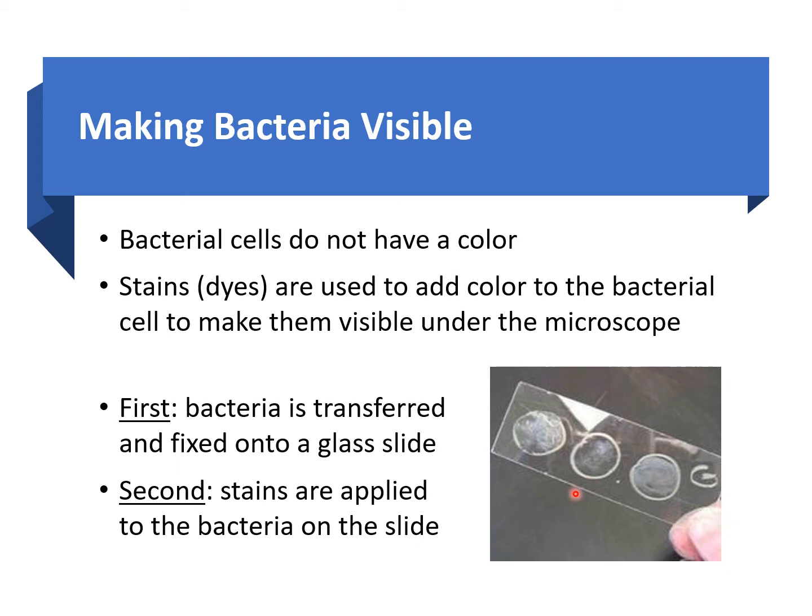And again, one way for you to figure out whether it's thin or not, look at your smear. You don't want it to be very white. And then, as I said, you want to make sure that you spread the bacteria throughout so that you don't have it chunky, a lot of bacteria over here and then nothing over on this side. So you want to make sure that you spread it evenly.